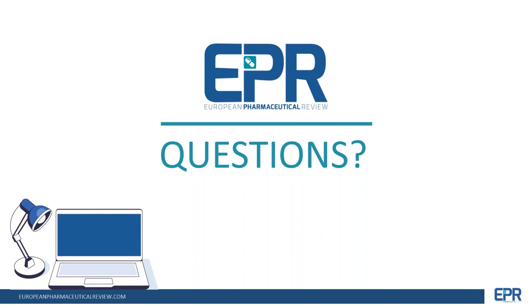Okay, moving on to another question. How long does the system take to switch from an oligo method to protein analysis method? Who can answer that one? I can take it. For switching between methods, you would just have to remove the chip, and then you prime the autosampler and a new chip with the new background electrolyte solution. And that overall process should take no more than 15 minutes. And you should be able to start analyzing your protein samples right away.